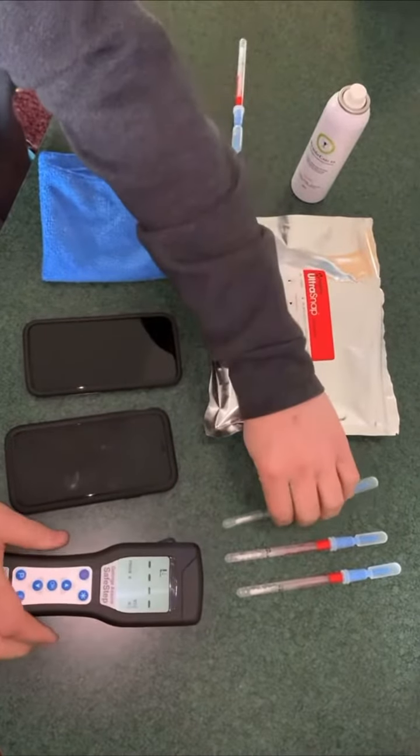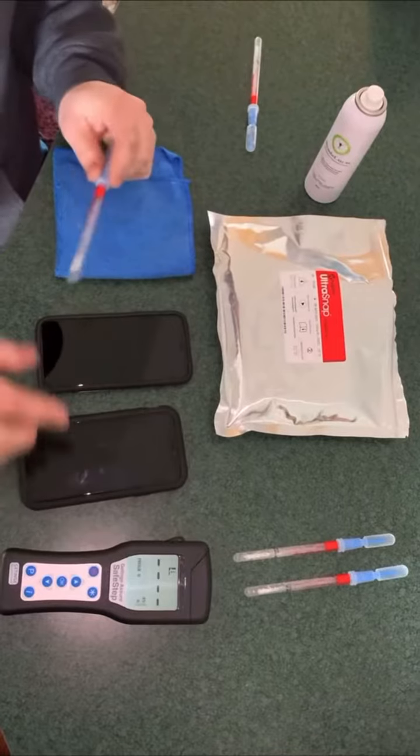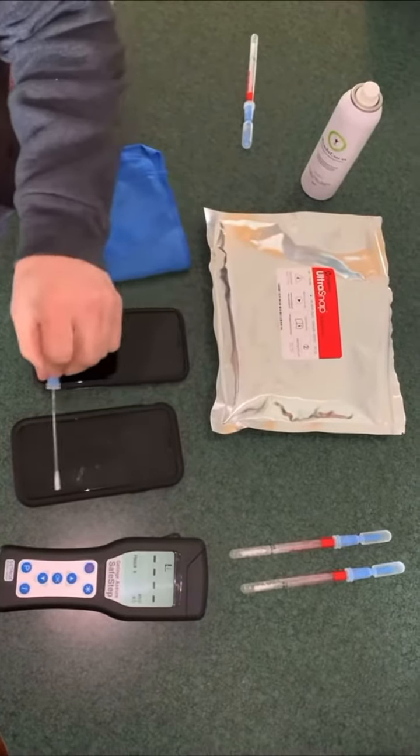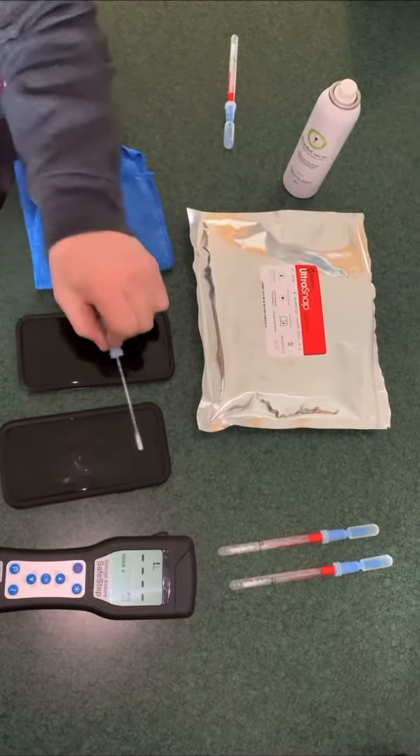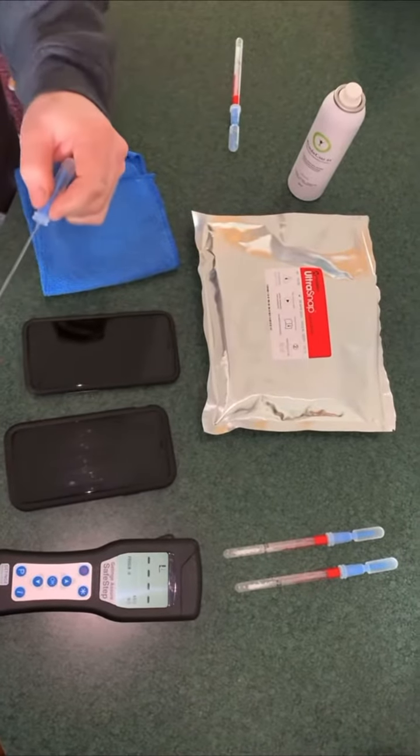So now we're going to test one that hasn't been treated. This is Braden's — my son's phone. We're going to test his as well, and then we'll treat it while we're waiting for the results. We're going to wipe that down.